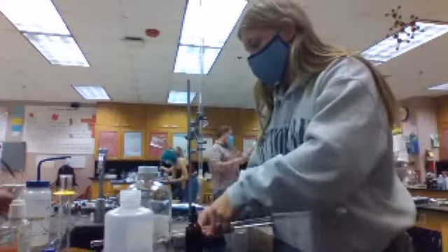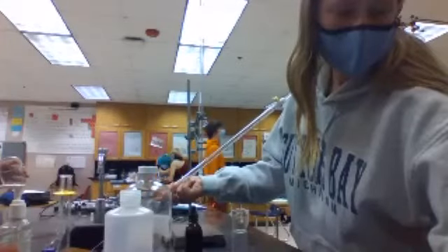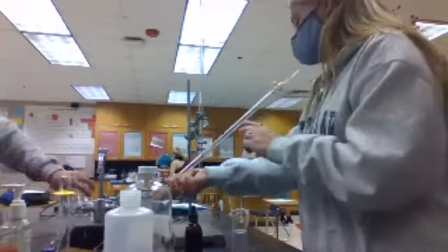All right, here we go, guys. Line, I don't know how. This is 0.950 molar concentrated base. Can someone change it to be a line? Because I don't know how. Oh, finally. Is that the molarity of the base? That's the hydrogen ion concentration.